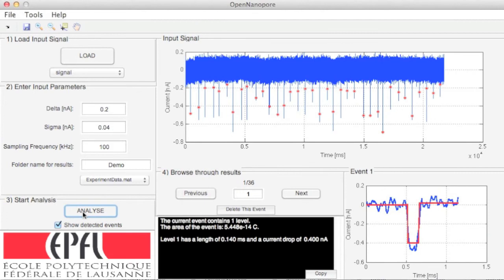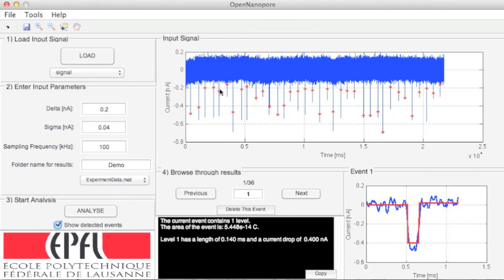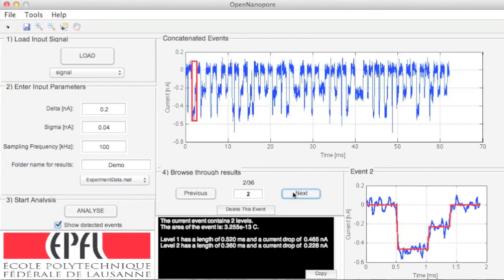Let's now move to the verification step. In order to verify that the analysis has worked, you can visualize the results and remove errors. You can show or hide the detected events. Then, you can browse through your results using the previous and next buttons to move from one event to another.